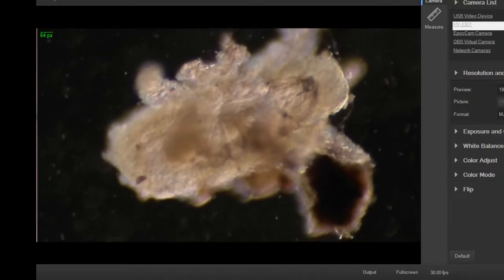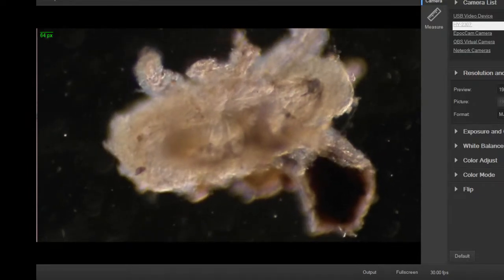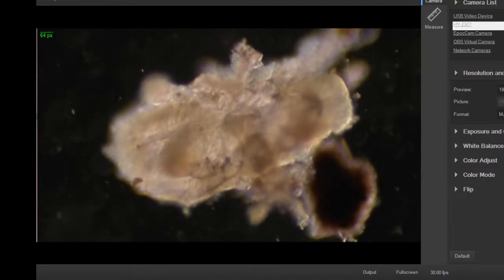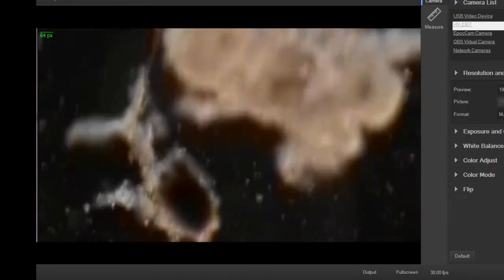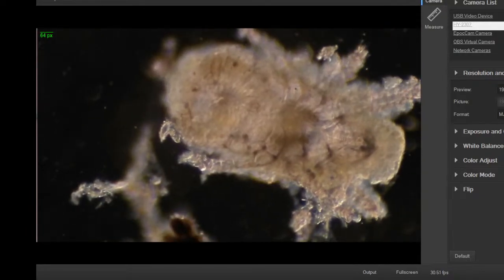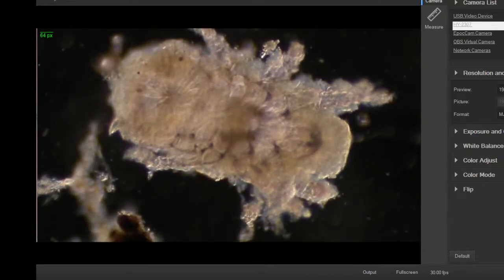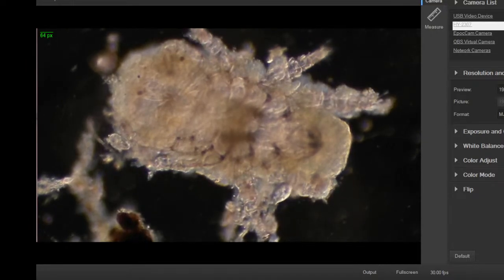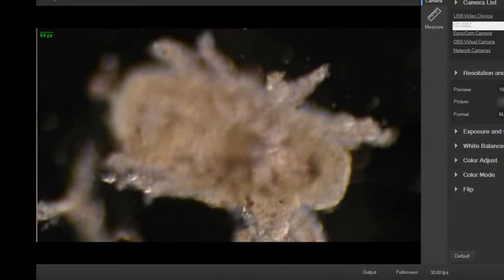Just for kicks, let's put a little cover slip on it and see how it affects the mobility. I might actually kick him out if I do this. Let me move this eyepiece out of the way a little bit. Put that down and see where he left off. Yeah, see, a much more constricted movement now. It's a much thinner playground. So he can't quite curl out his legs as much or fully stretch out.